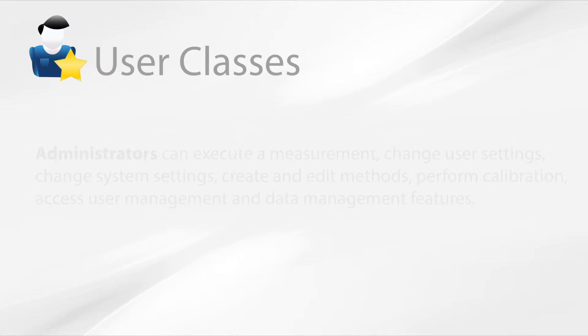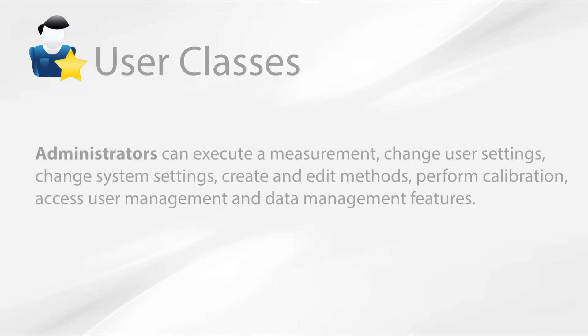Administrators can execute a measurement, change user settings, change system settings, create and edit methods, perform a calibration, and access user management and data management features.